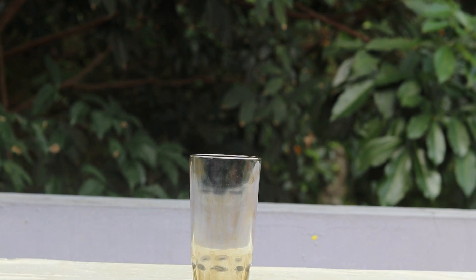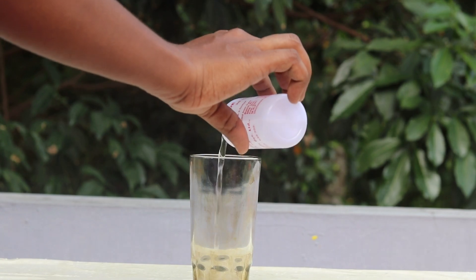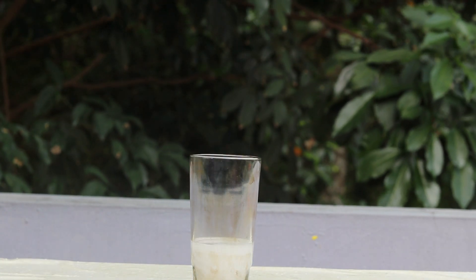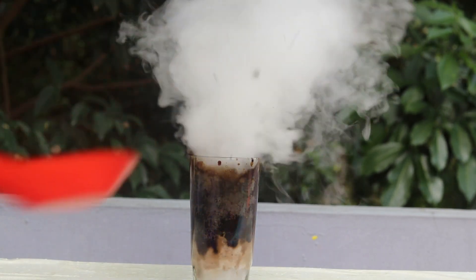Let's try this hydrogen peroxide solution. 1 teaspoon potassium permanganate. Let's try this reaction.